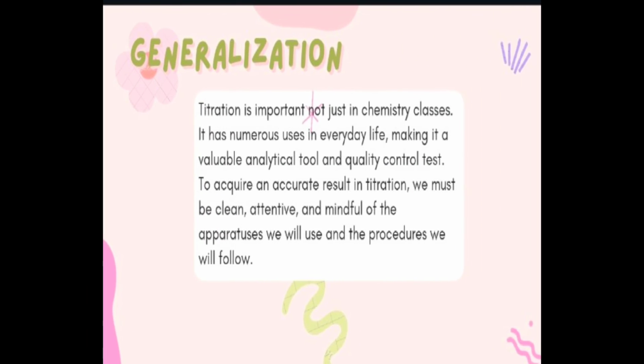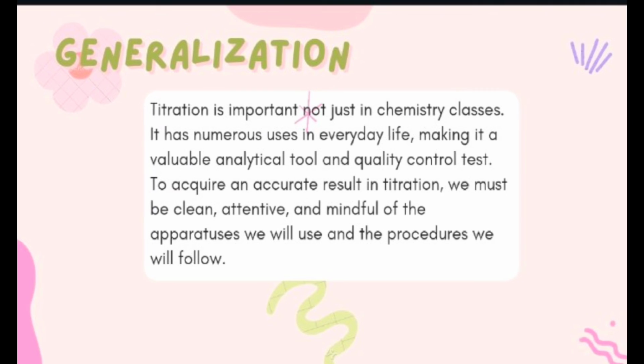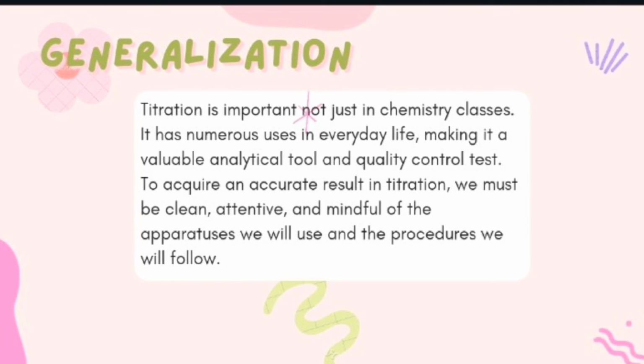So my generalization is titration is important not just in chemistry classes. It has numerous uses in everyday life, making it a valuable analytical tool and quality control test. To acquire an accurate result in titration, we must be clean, attentive, and mindful of the apparatuses we will use and the procedures we will follow.